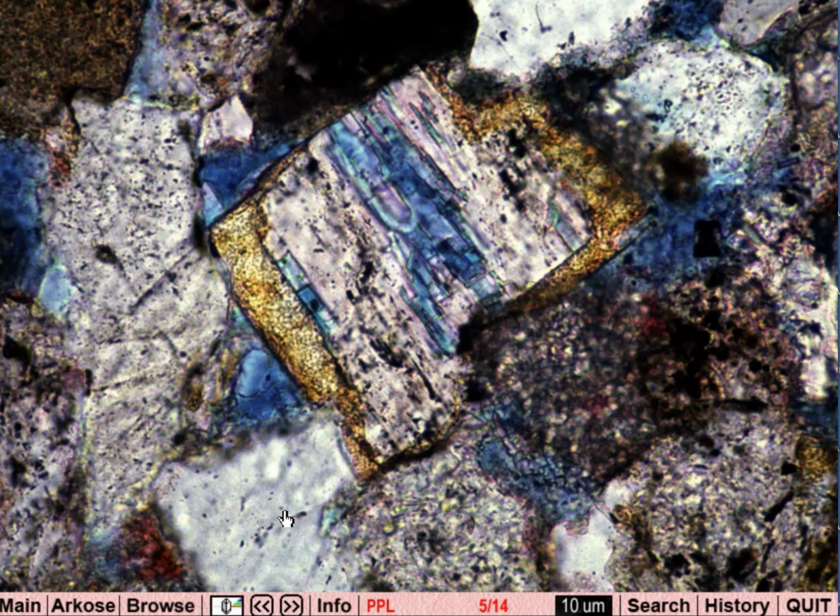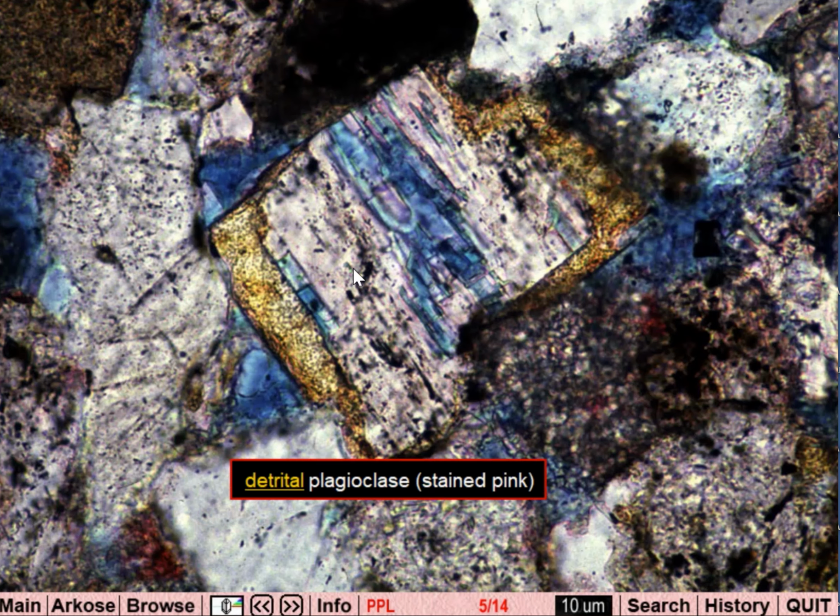Okay, this is another fantastic example. You're going to get the sense here. What's the yellow stuff? What's the pink stuff? What's the white stuff? The quartz, primary porosity, outside the grain, plagioclase. And much of this plagioclase has dissolved. We have only a few remnants.